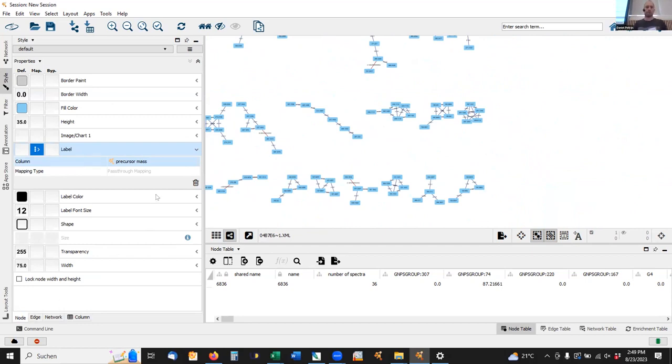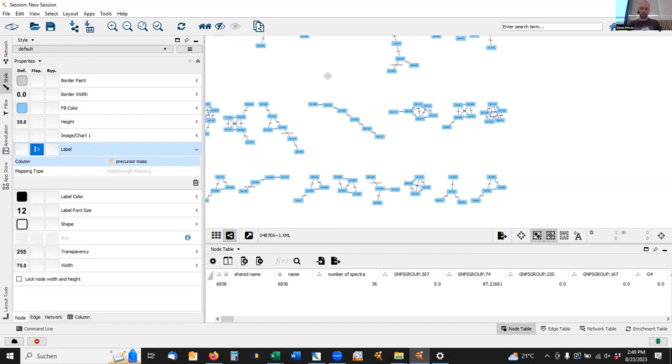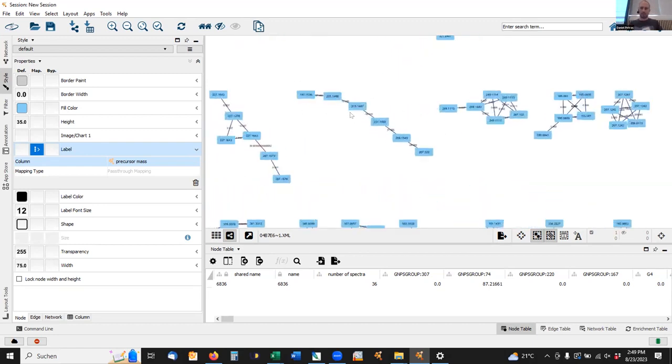Like in this network, these features highlight quickly the most relatively abundant molecules. And then I could also load in any other information that might be valuable for me. A very classic thing that I'm not going to do here is that we typically build a log ratio between our control and knockout, and then I could visualize such information in here too.